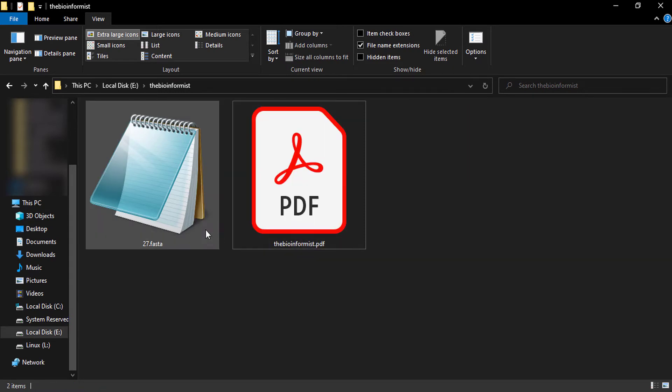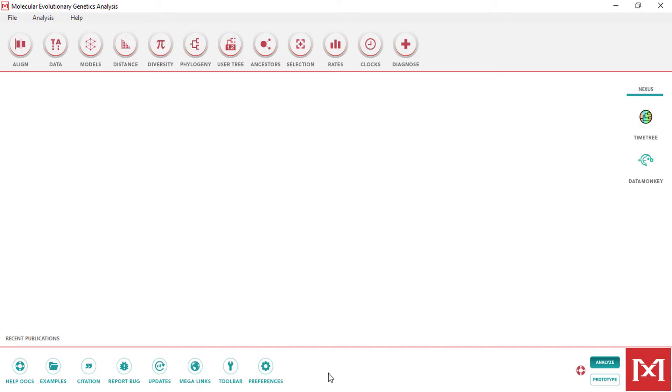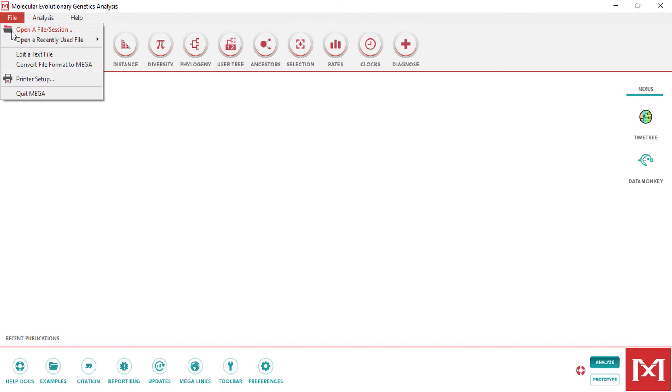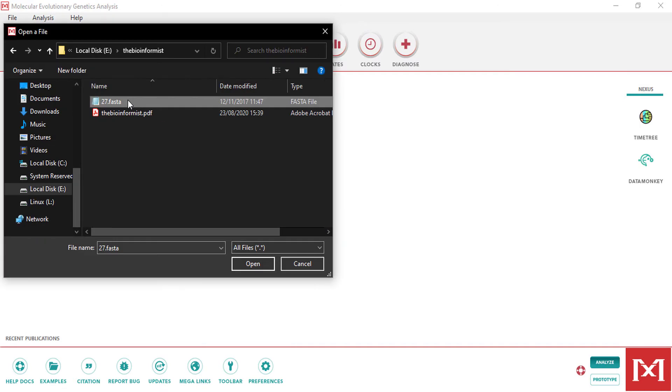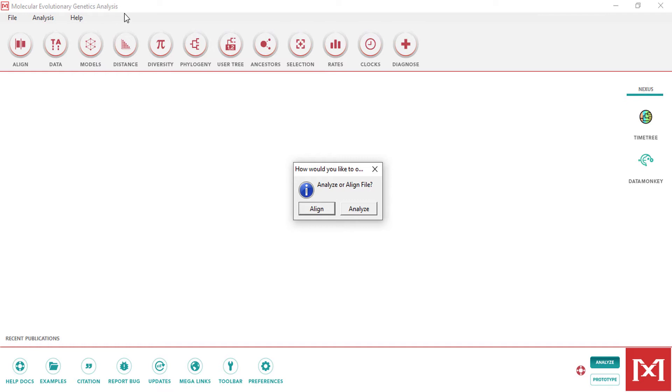Import this FASTA format into our MegaX file. Open a file session. Here I can open this FASTA format into MegaX. When I open my FASTA format, it prompts this message: I want to align the file or want to analyze the file.